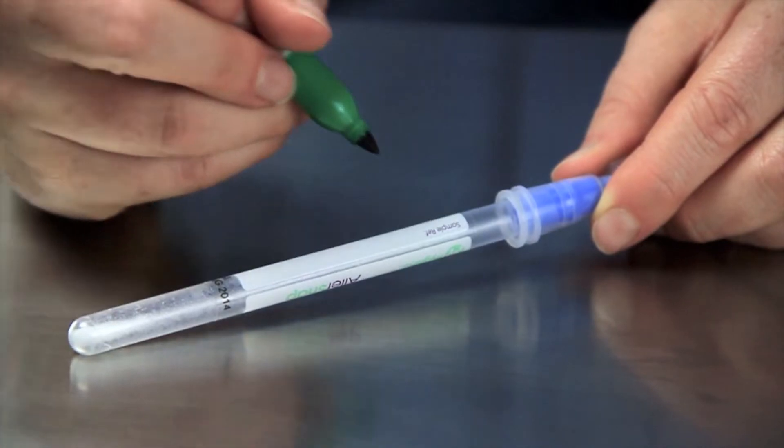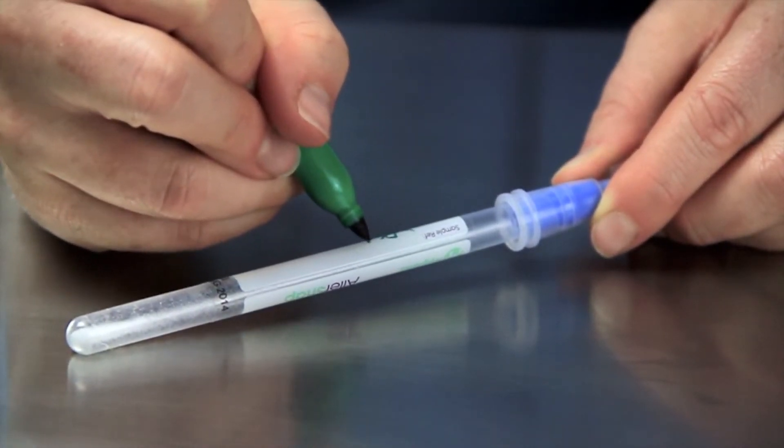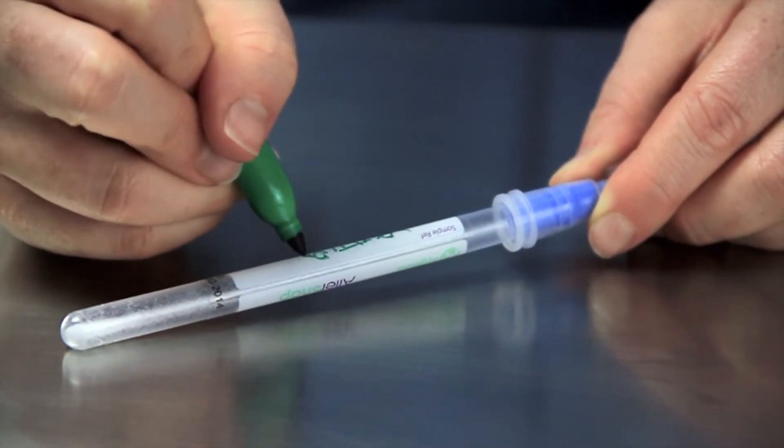Now let me show you how easy it is to use these tests. Allow the devices to reach room temperature before using them. Write the location of the swabbing site on the label of the tube for easy identification.